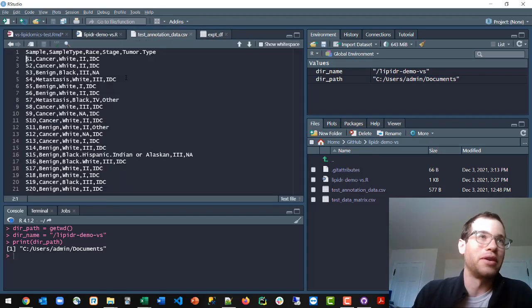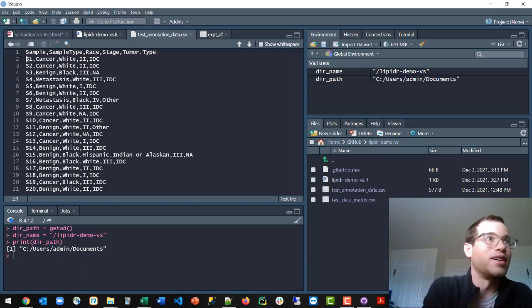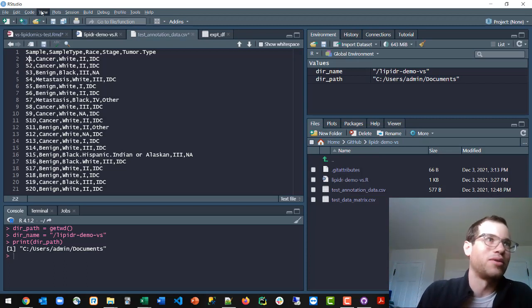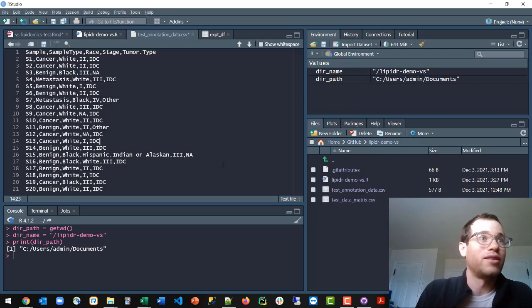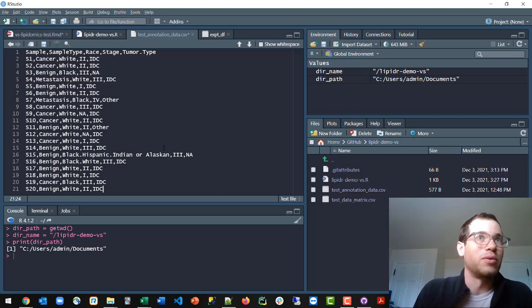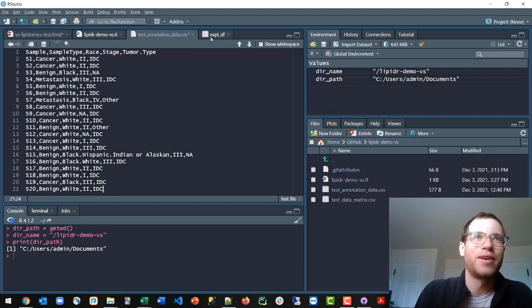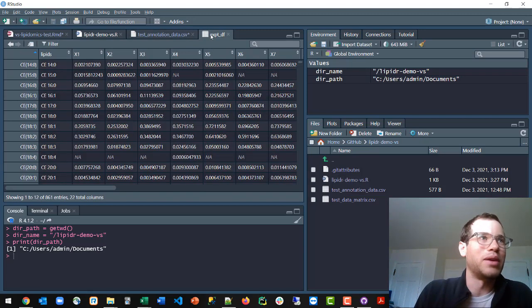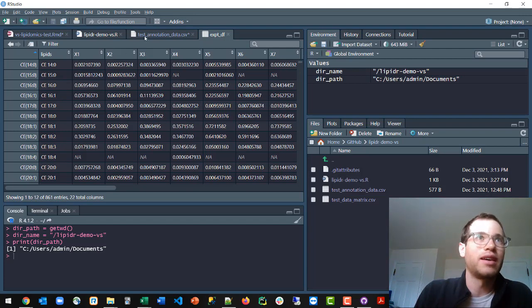So X1, it's really a sample one. And you would want to say, if this is real, you'd say X here and replace S with X. But basically, you need these names to match up on all these guys for this to work. And so I should definitely do that. And I'll update that in the repo.